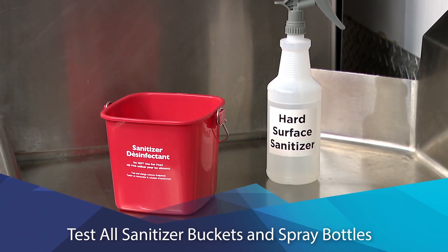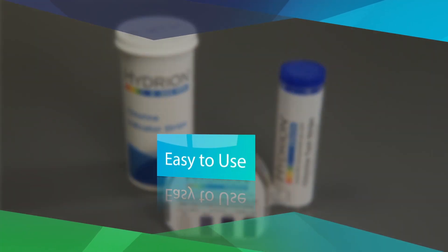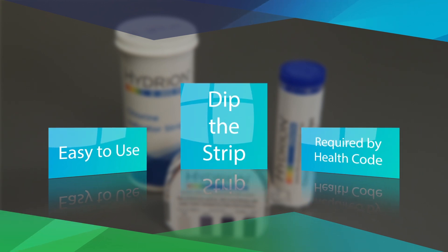Be sure to test all sanitizer buckets and spray bottles too. Test kits are reliable and easy to use, and they're required by Health Code. So always remember to dip the strip.